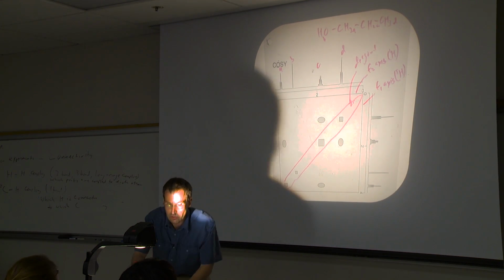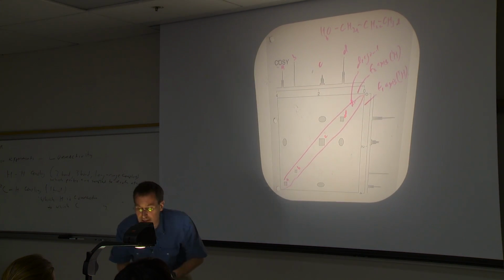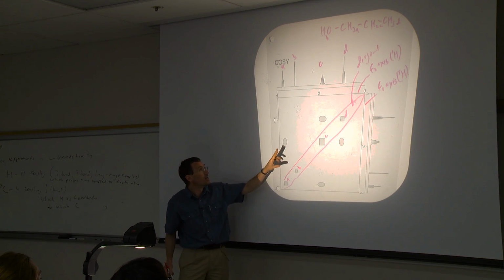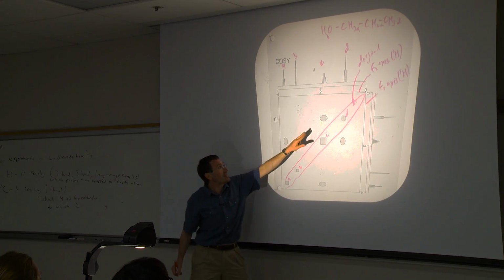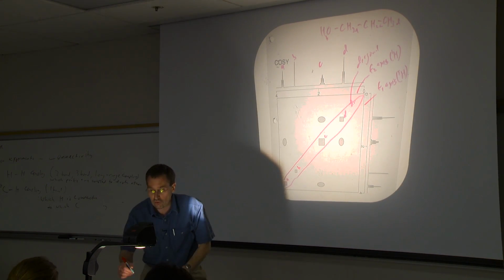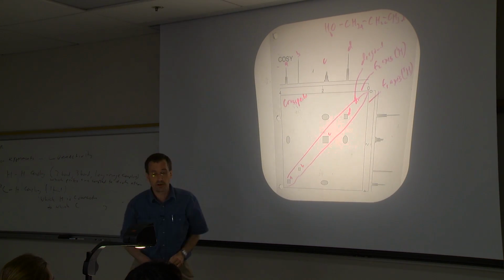So you see a peak here that corresponds to A, corresponds to B, corresponds to C, and corresponds to D. Those aren't important. That's not going to give you any new information. The diagonal doesn't give you new information, but these guys here, symmetrically disposed about the diagonal, these are what are called cross peaks. And the cross peaks are what give you the new information.